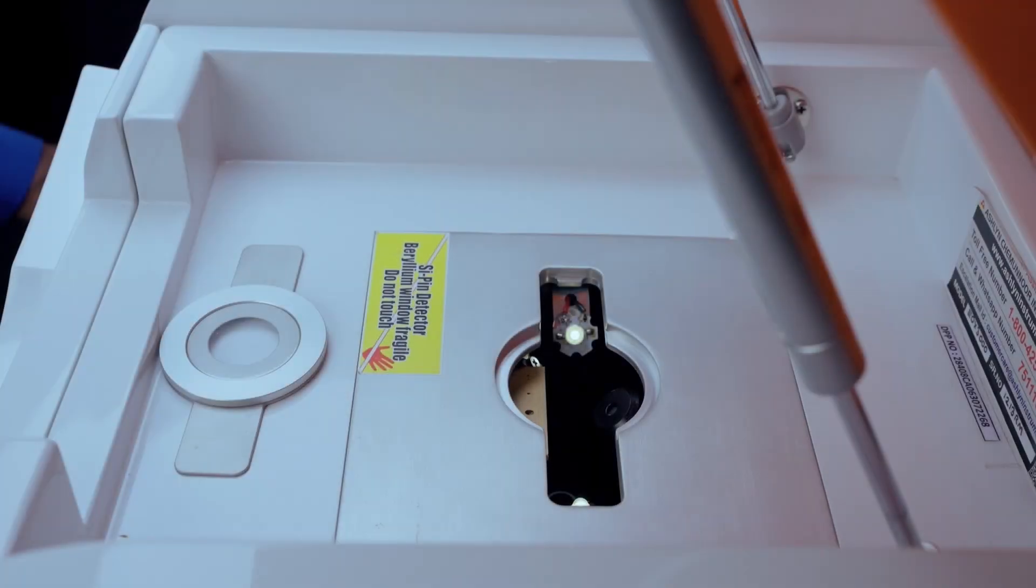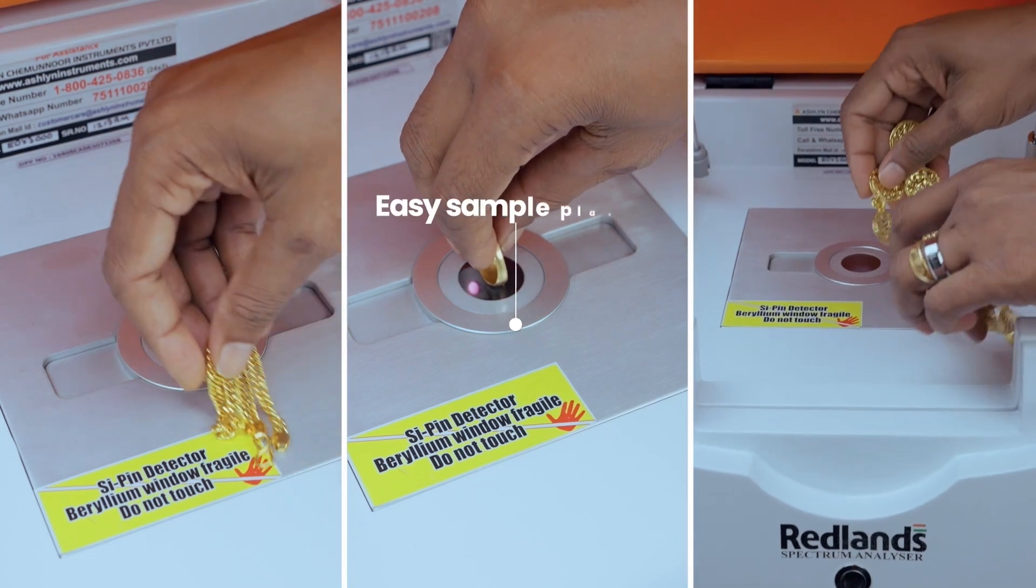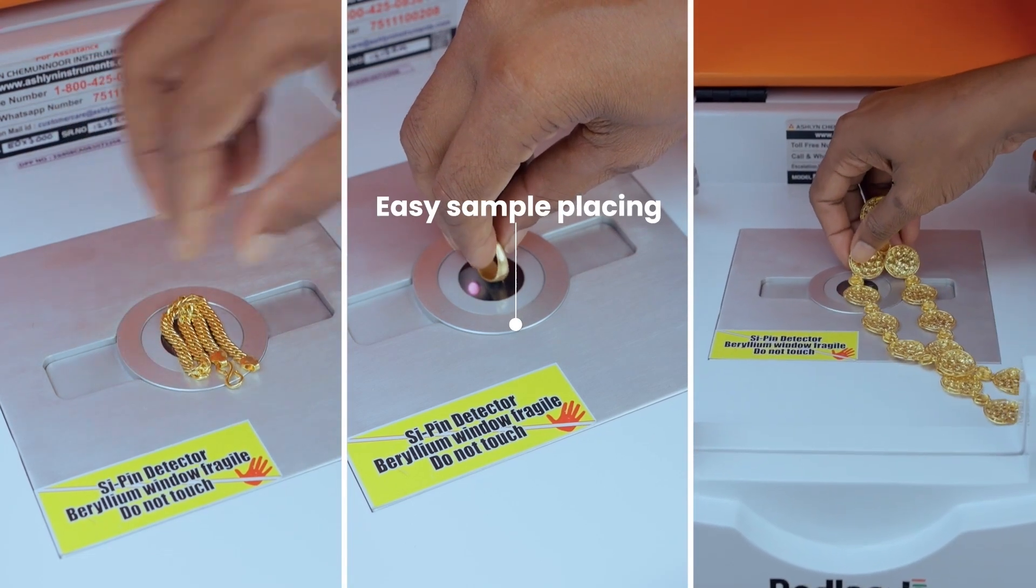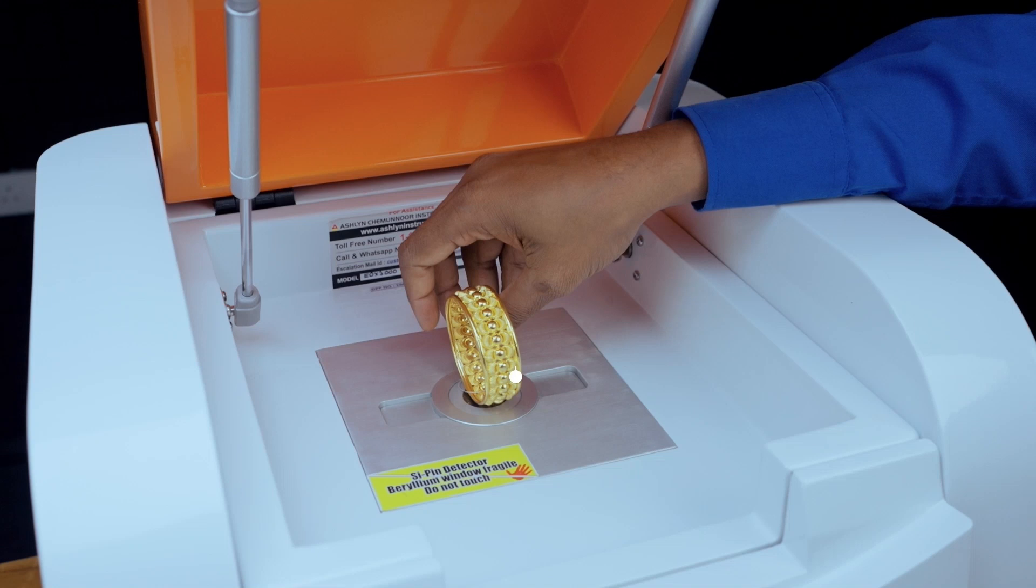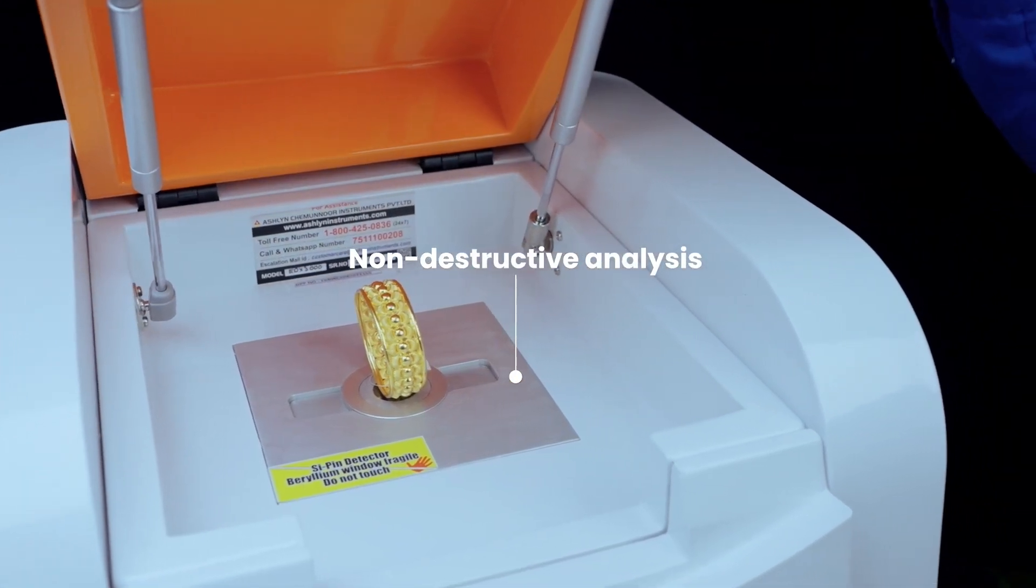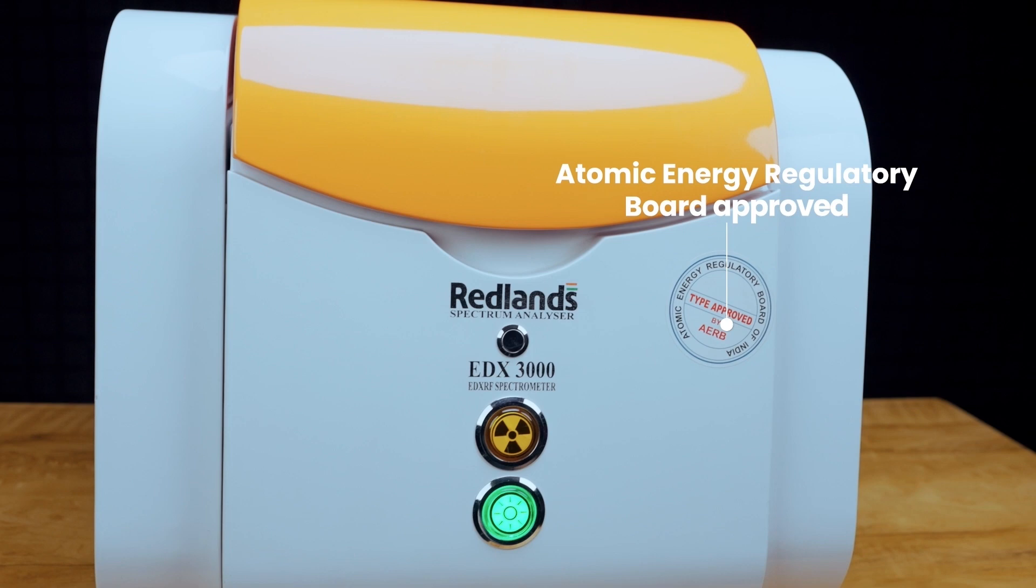Key features include 20mm wide area scanning along with spot scanning due to the multi-collimator, a bigger sample chamber to accommodate any ornament, non-destructive analysis, accuracy, radiation safety certification, and more.